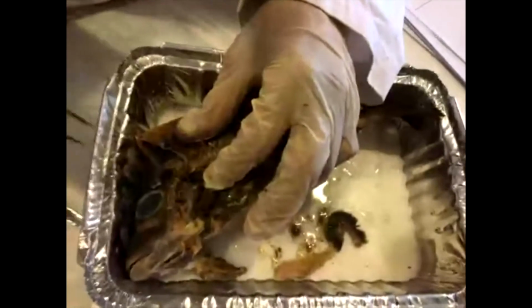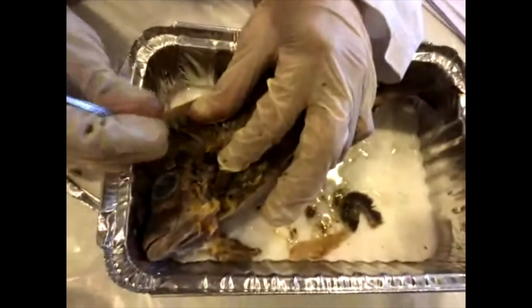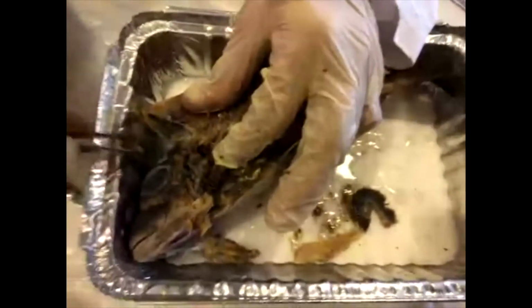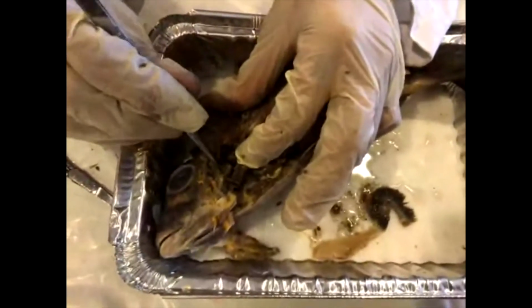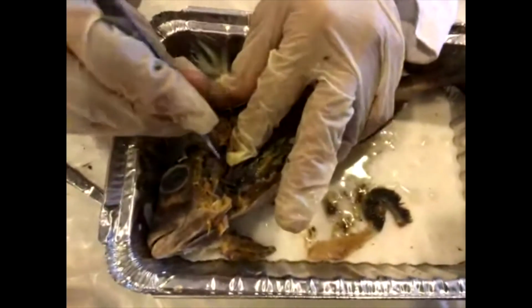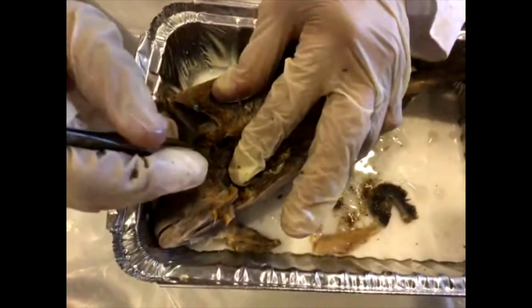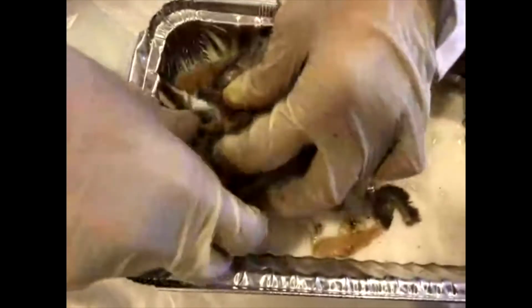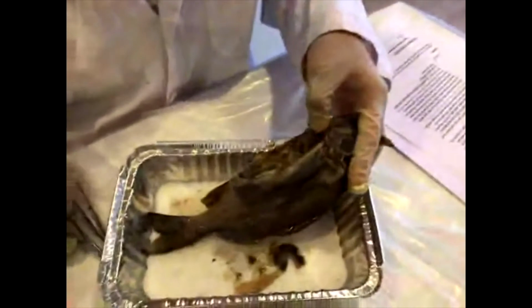So hopefully we can actually extract this heart because it has two chambers, which is a development for organisms like this. Animals that we consider maybe less evolved or less developed would have a single chamber heart, but this fish has two. Just bear with me one moment.